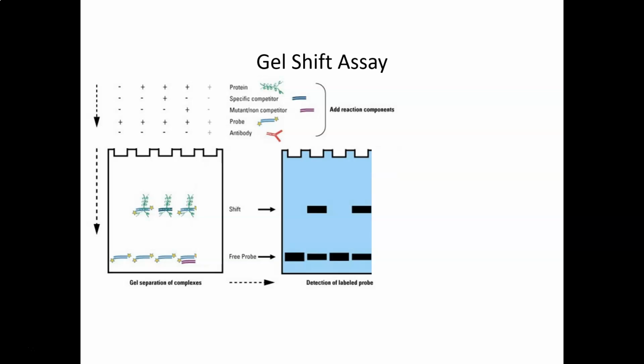Sounds good. Now the critic comes back and says, you know what? Still not convinced. What you've shown me is that a protein in the tube is binding to the probe with specificity. You haven't shown me that your protein is binding to the probe with specificity. In other words, I don't trust your biochemical skills, and I think that when you did this protein prep, you didn't just get your protein, you got some contaminating protein in the background too, and it's that protein that's binding to your probe with specificity, not the protein you're actually studying. So you do one more control experiment.